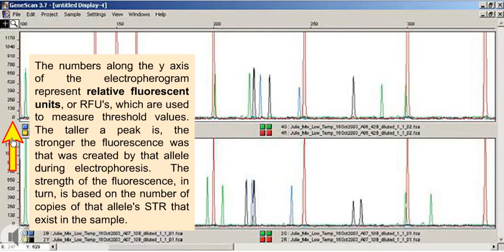The taller a peak is, the stronger the fluorescence was that was created by that allele during electrophoresis. The strength of the fluorescence, in turn, is based on the number of copies of that allele's STR that exist in the sample.